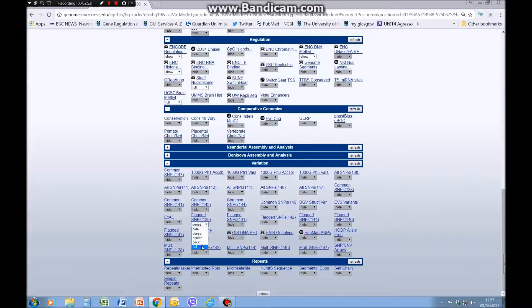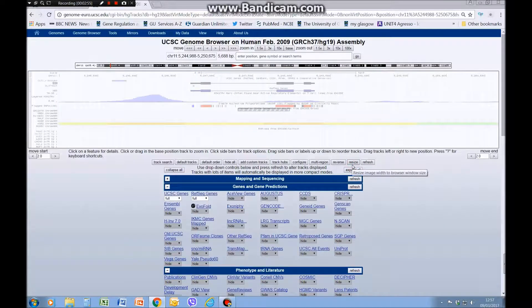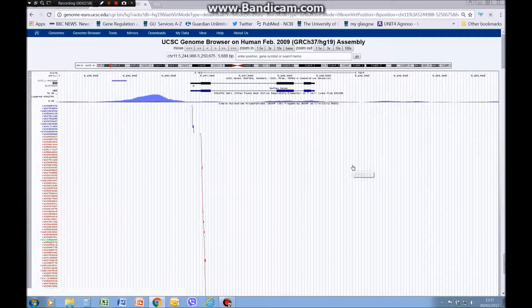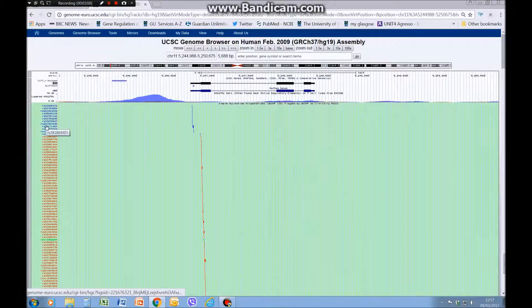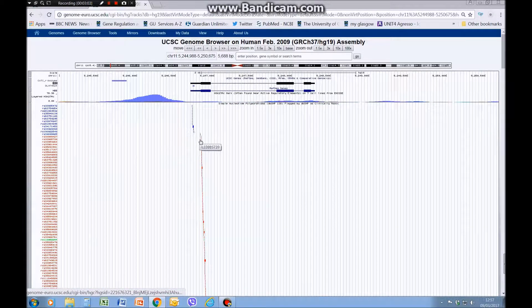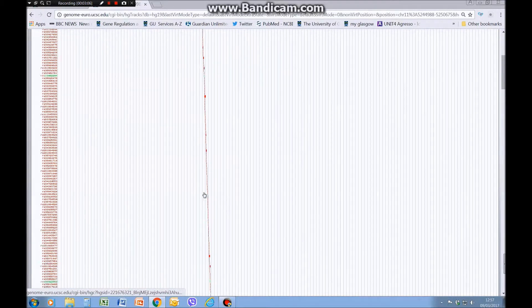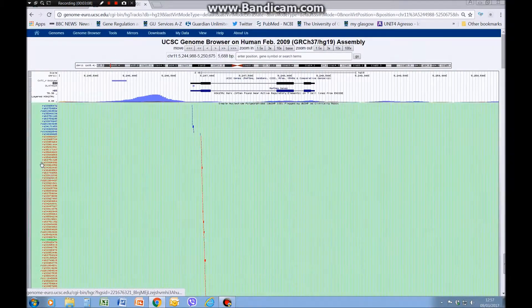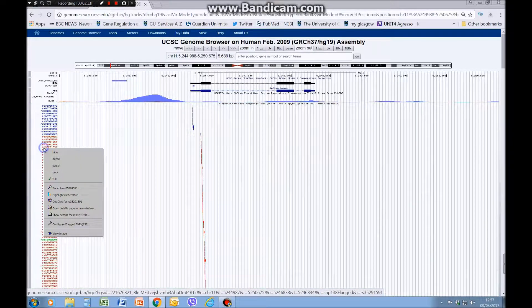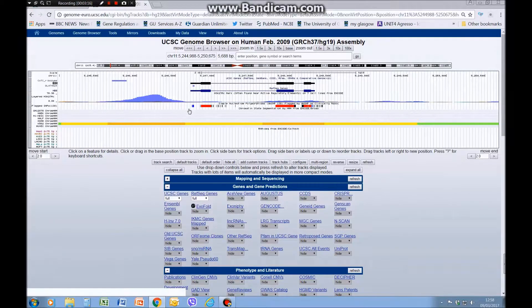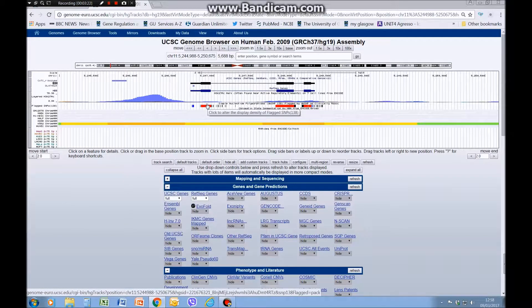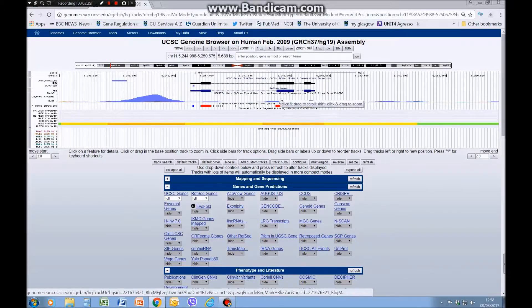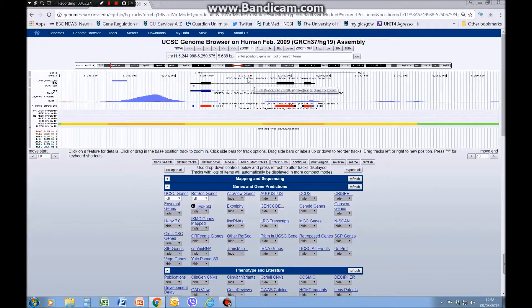Just pick one, set it to full, and click refresh. You can see all the different SNPs with their numbers displayed, lined up with the region of the genome where they're found. This is useful if you want to look at individual numbers, but it's not so helpful for a general overview. If you right-click and change the view to dense, it squishes them all up. Now you can see that most of the clinically relevant SNPs for the beta-globin gene are found in the exons, with only a few in the introns.